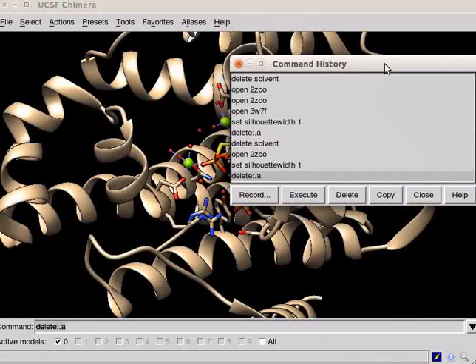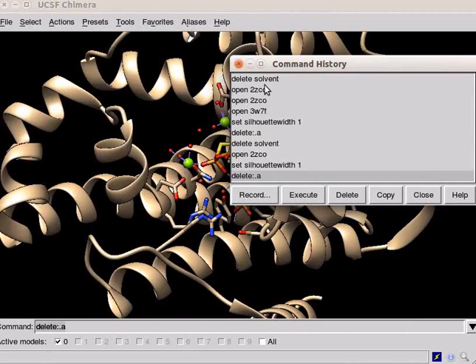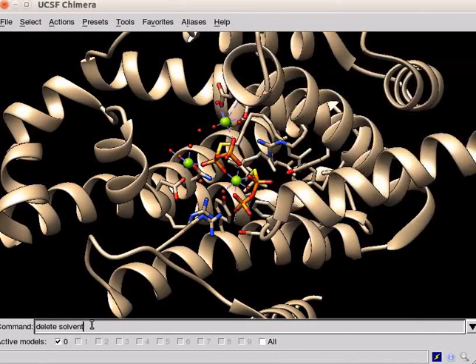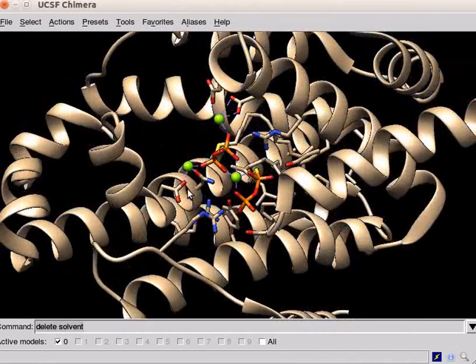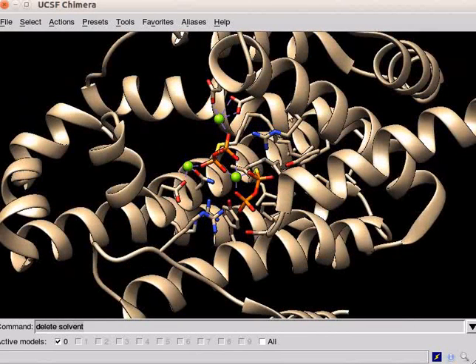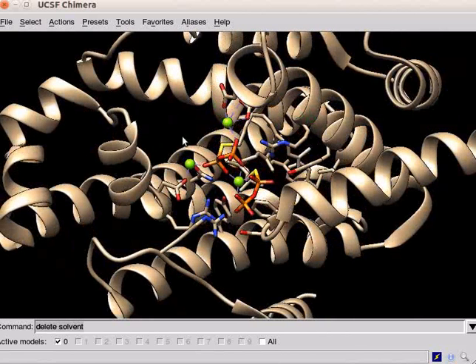Next, to remove the solvent molecules from the structure, I will select the command delete solvent. Press enter. This structure is bound to the substrate analog farnesyl thiopyrophosphate, FPS in short.